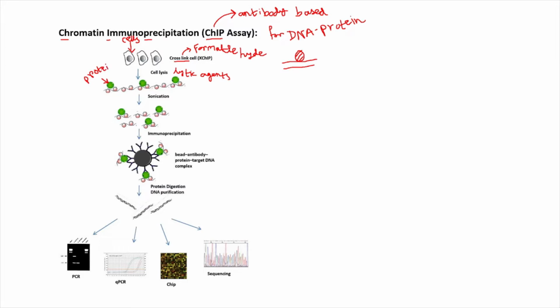Okay, so you can see these proteins have bound to the chromatin, to places in the chromatin, and these pinkish ones are the chromatin. Here you can see the proteins have bound to the chromatin.